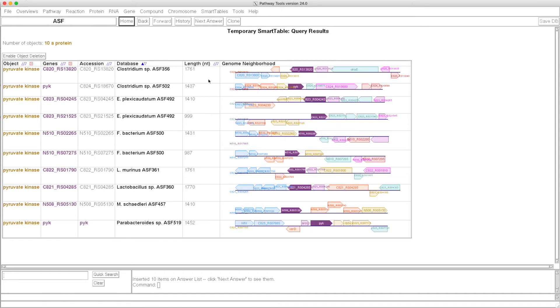In this smart table, it's showing us the protein, the gene coding for it, accession number, which organism it's in, the length of the gene, and then the surrounding genome neighborhood.